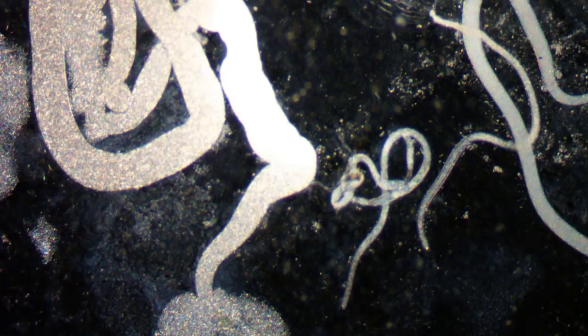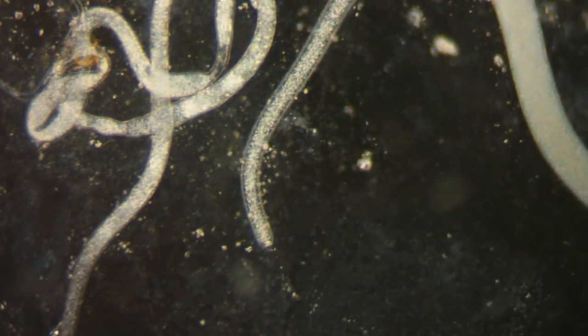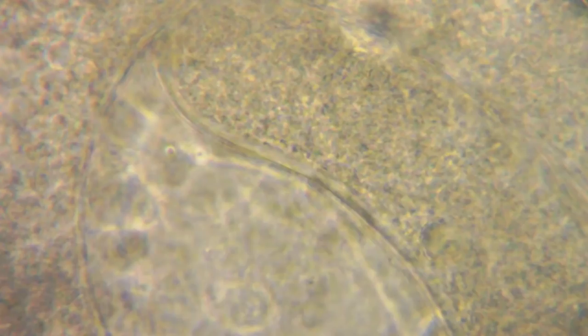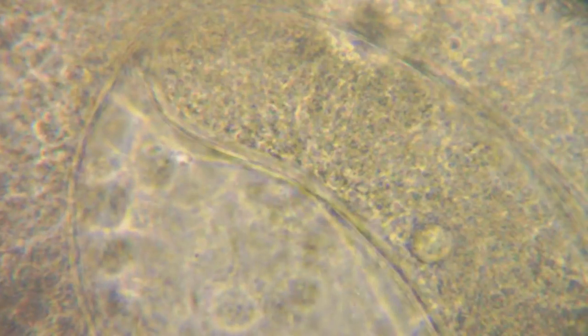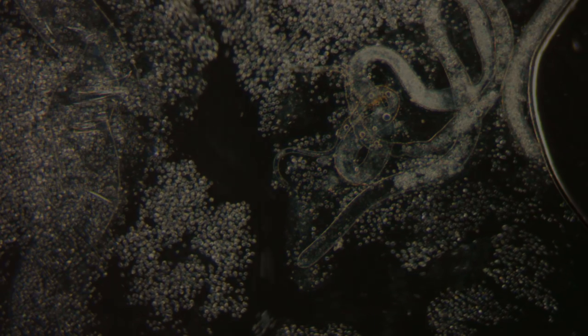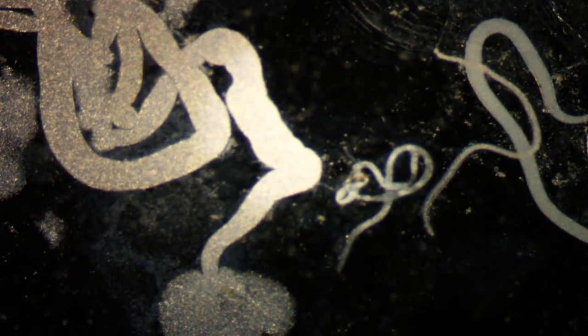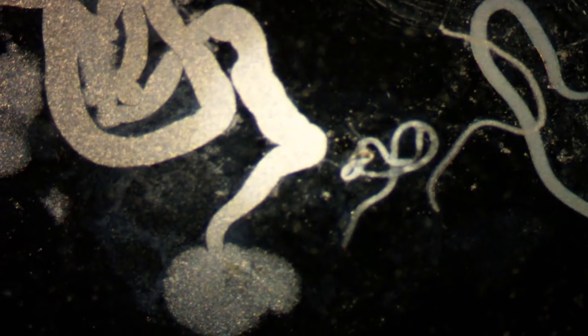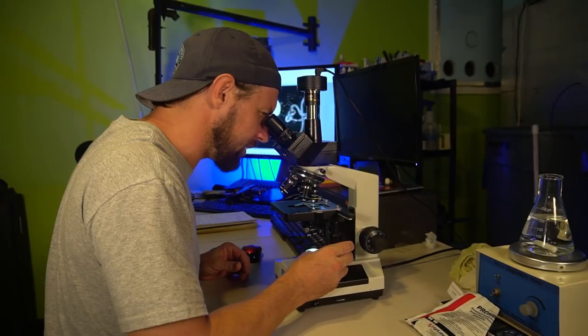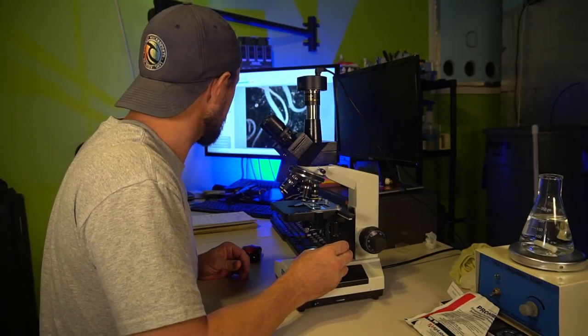All right. Oh wow, that is crazy. That is crazy stuff. That looks like some kind of a, it almost looks like some kind of a tapeworm. Not really a tapeworm, but some kind of a worm, a nematode, something like that. Oh man, that is crazy stuff.